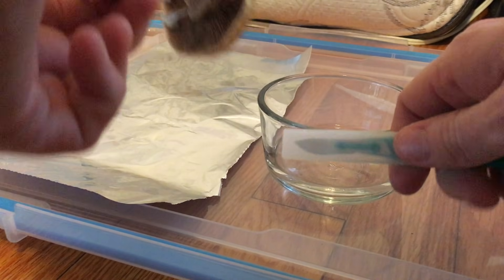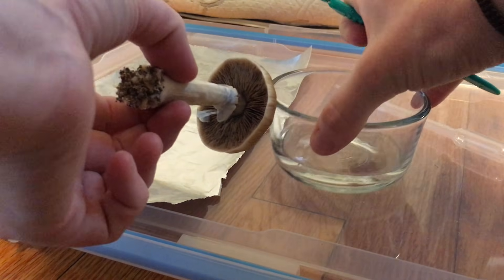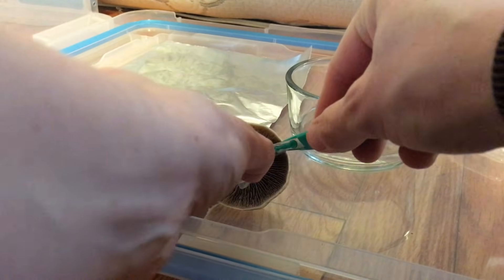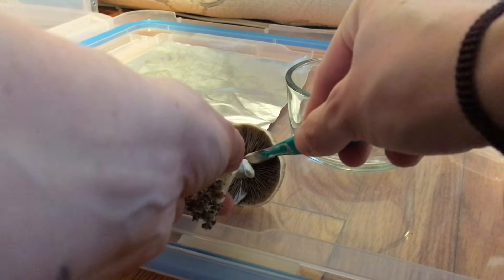Then you'll want to cut off the cap with a sterile blade and carefully place the mushroom gills onto the aluminum foil face down.